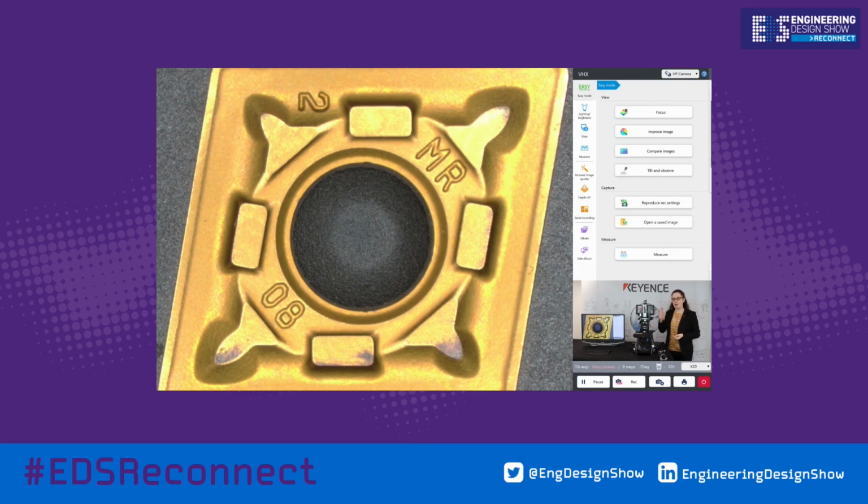As you can see, our microscope is a little bit different from the traditional systems that I was just describing, because there's no eyepiece. Usually you'd have something like a binocular or a single eyepiece that you'd look through. We've actually got a camera. So we've got this camera, which is a high performance camera. We also have something called our FI head, which is a fully integrated head, which I may come on to later.